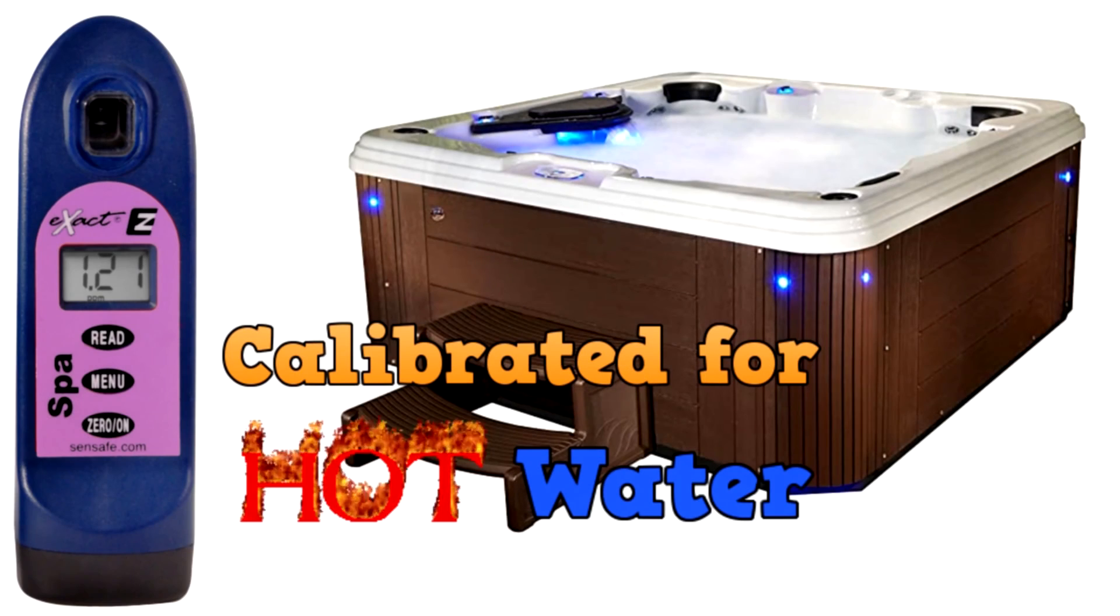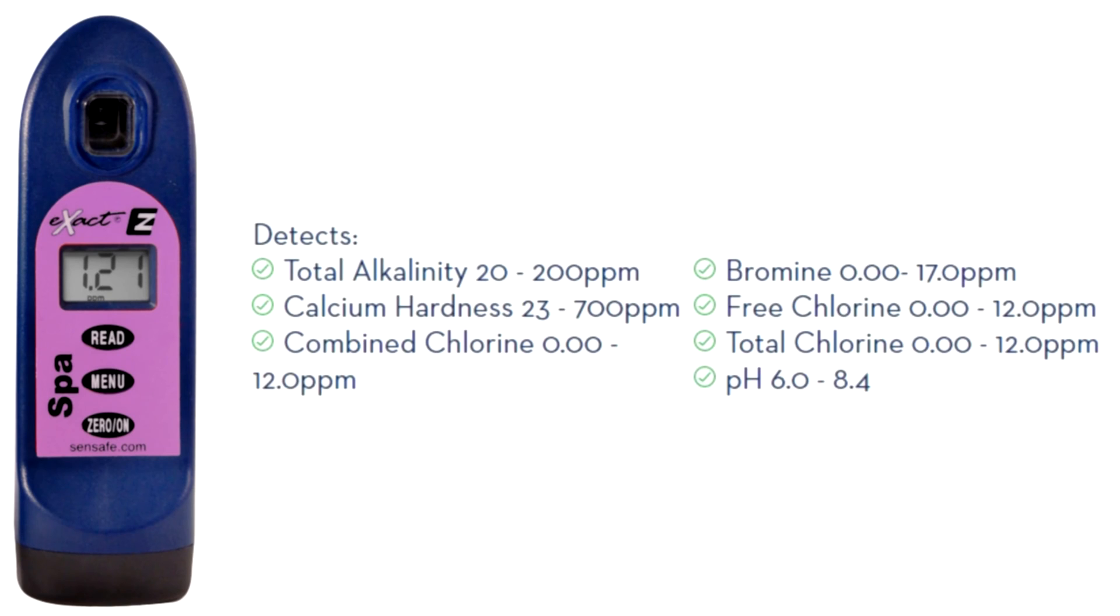The Spa Exact EZ has been specifically calibrated for the hot water that you normally would find in a spa or hot tub. It detects total alkalinity, calcium hardness, combined chlorine, bromine, free chlorine, total chlorine, and pH.